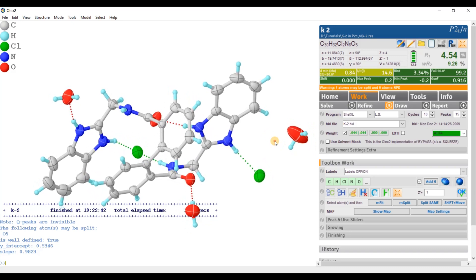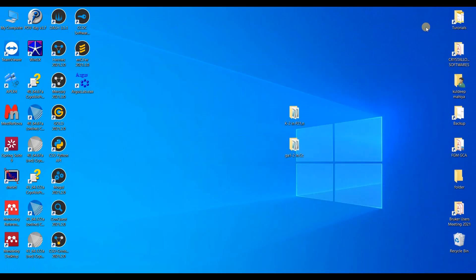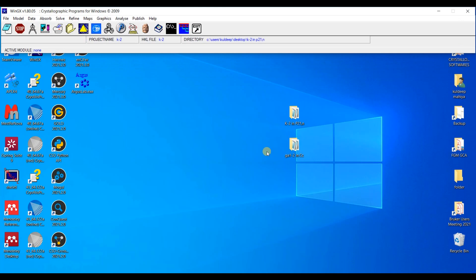Everything is looking so nice and almost green in color. So now, how to change this space group P21/n into P21/c? For this, I am going to open the software WinGX from here.